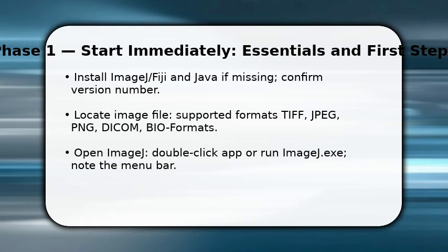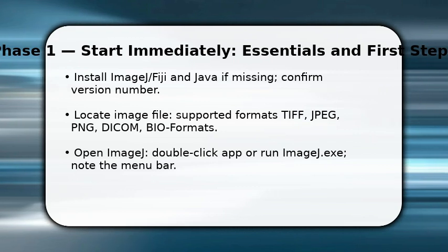You start by opening ImageJ now. Make sure the application and Java are up to date, because compatibility matters. Once launched, you'll see the toolbar and menu bar. This is where you'll control everything.